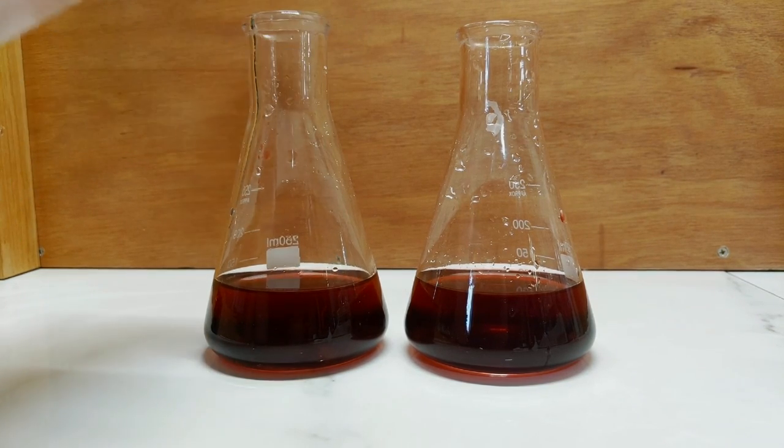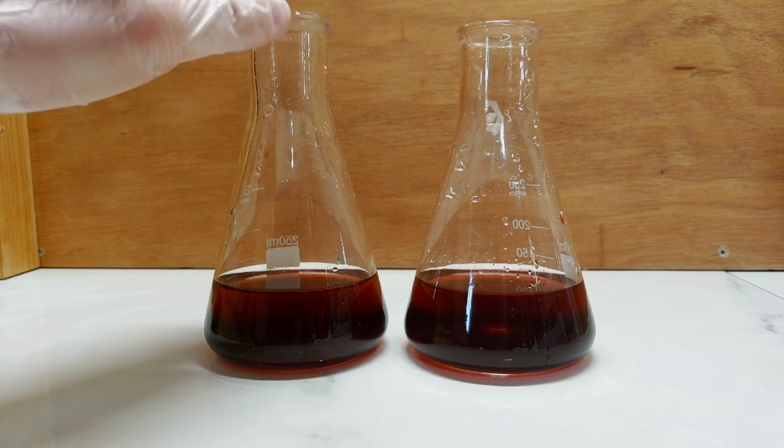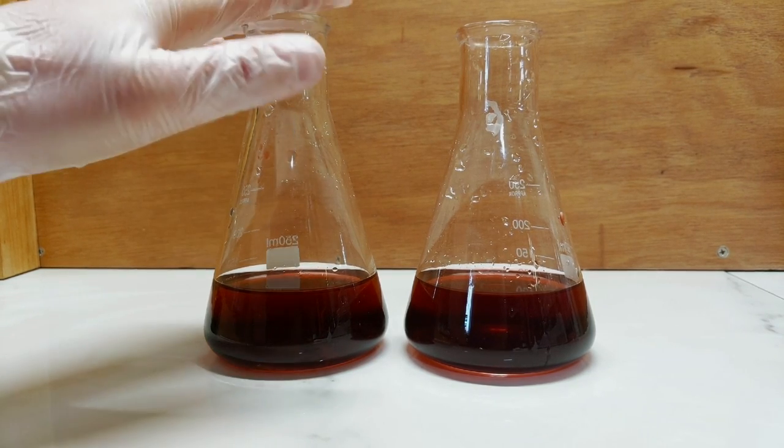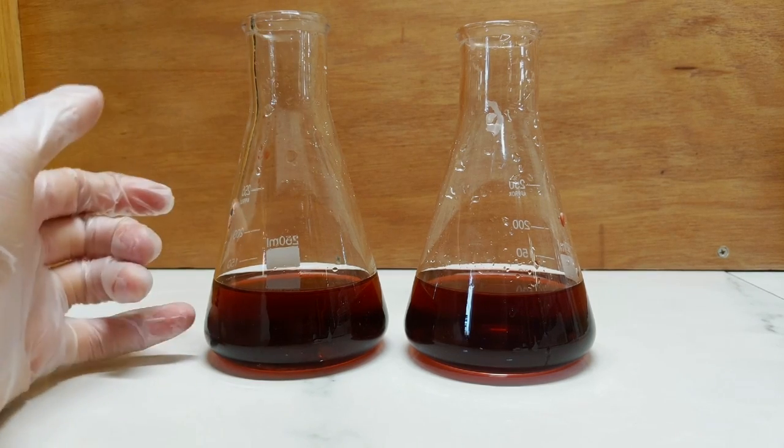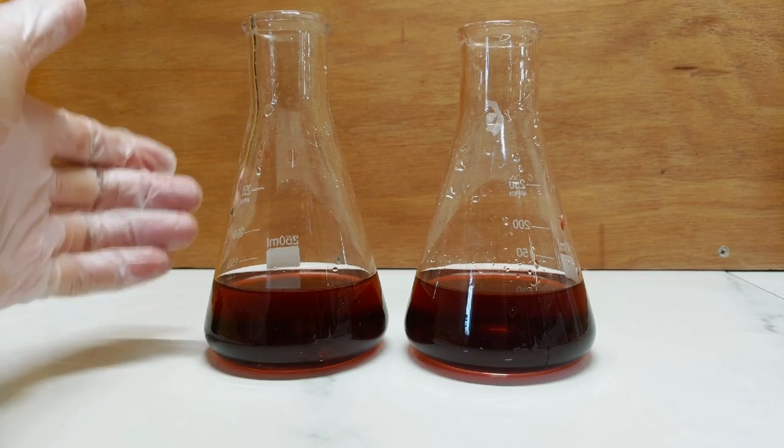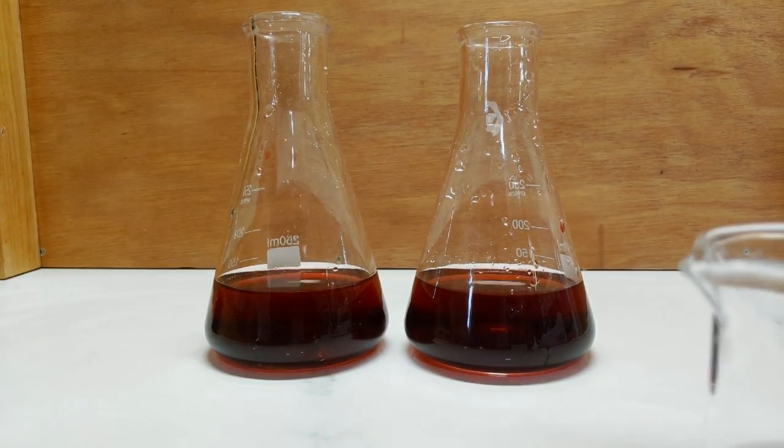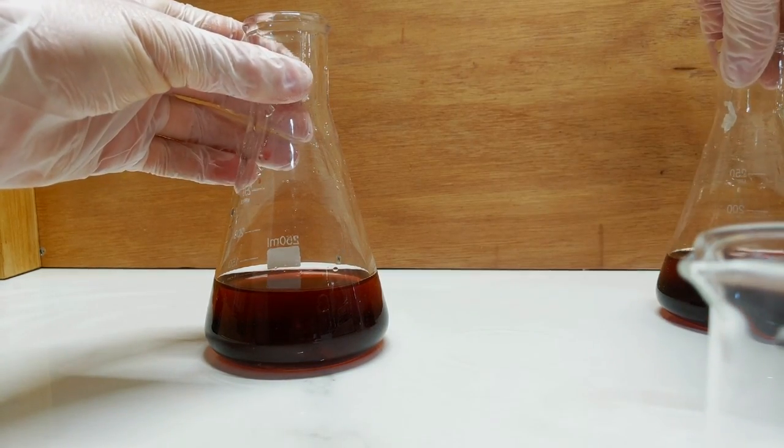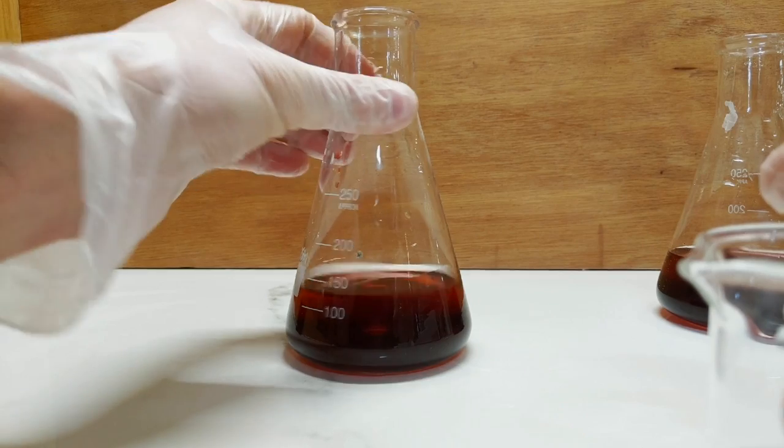And now we're going to basify these with an alkali, so I'm going to be using ammonia, just regular store-bought ammonia from the supermarket, and that should then start to precipitate out our cobalt ammonia phosphate, which will be our violet pigment. Pop that one to the side for the moment, and we'll just focus on this guy here.